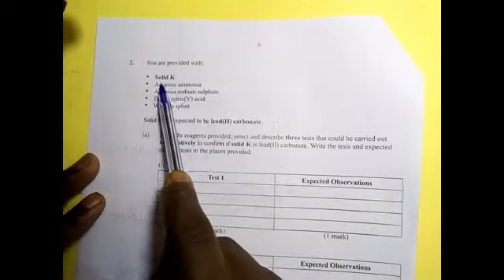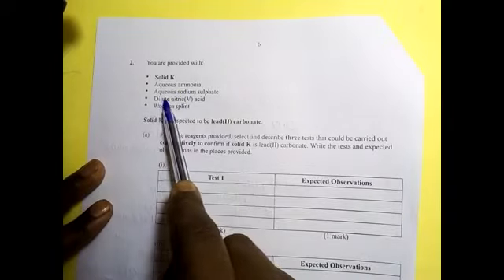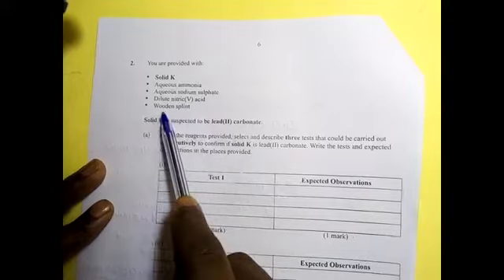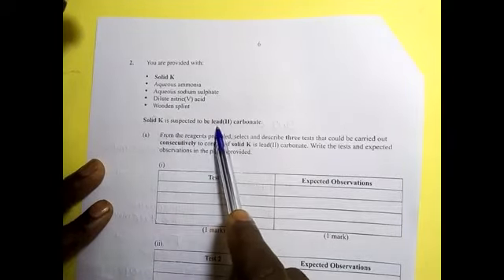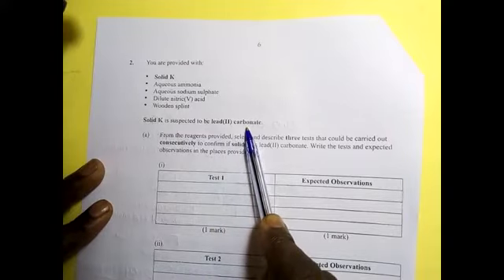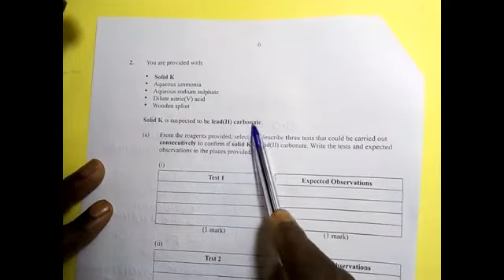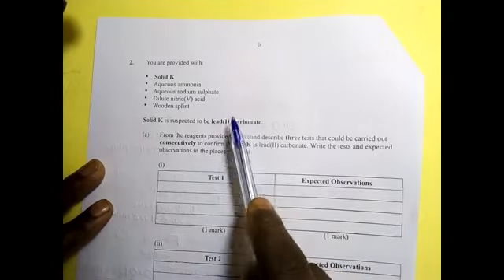You are provided with solid K, aqueous ammonia, aqueous sodium sulfate, dilute nitric acid, and a wooden splint. Solid K is suspected to be lead(II) carbonate. So you should understand the behavior of carbonates with acid. Whenever you add an acid to a carbonate, you expect effervescence.